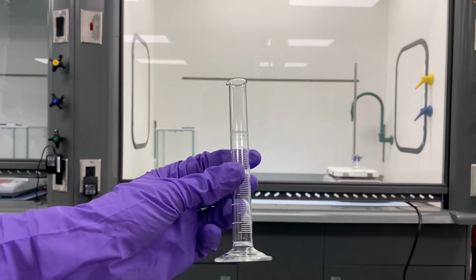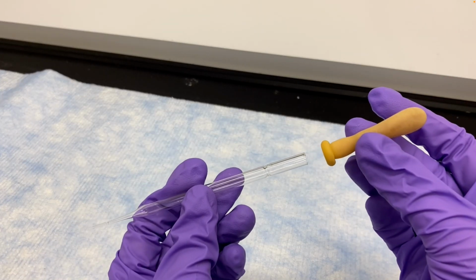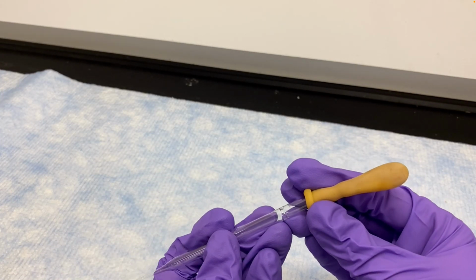And we're going to use something to measure out the exact amount of liquid we need. We're going to use something called a graduated cylinder. Gradus in Latin just means step. So if you do something gradually, you do it step by step. When you graduate, you're taking a step in life. And this is a graduated cylinder because it's a cylinder that has, you can see the lines here are all steps. Each step corresponds to a specific amount of liquid. So you can use these graduated cylinders to measure out specific amounts of liquids when you need them.